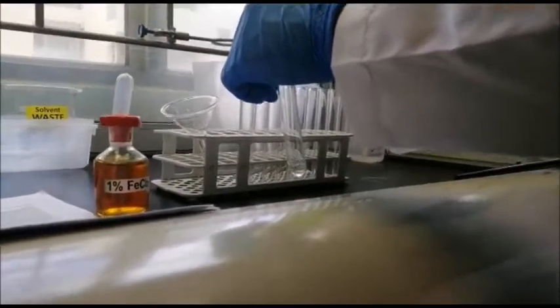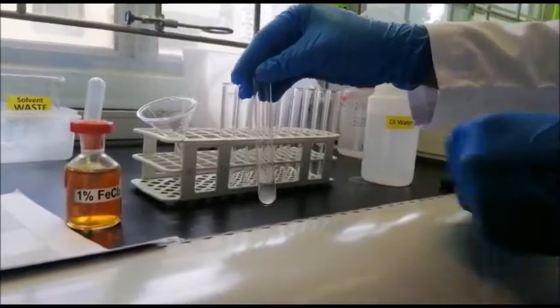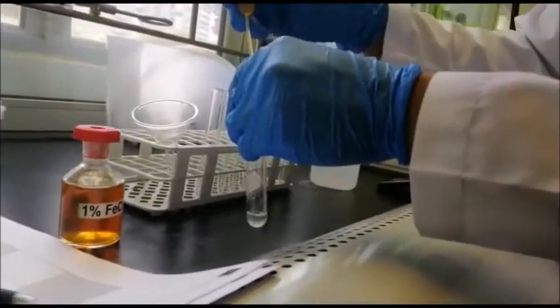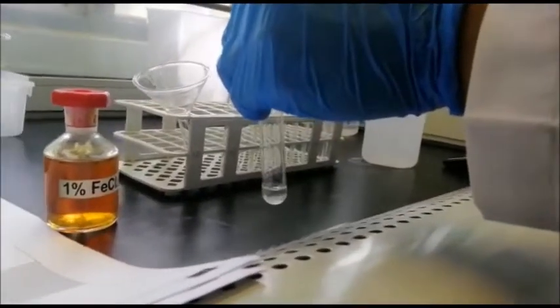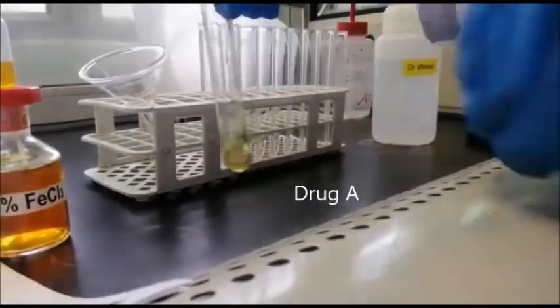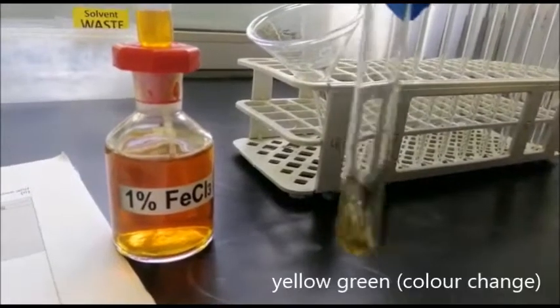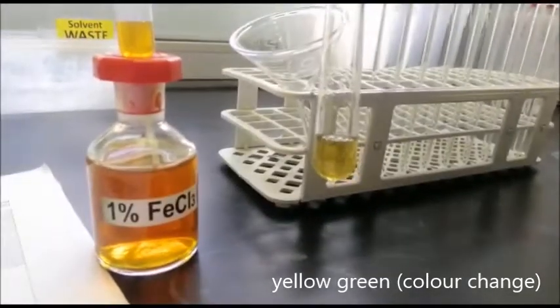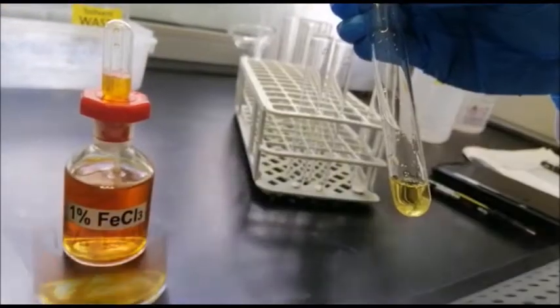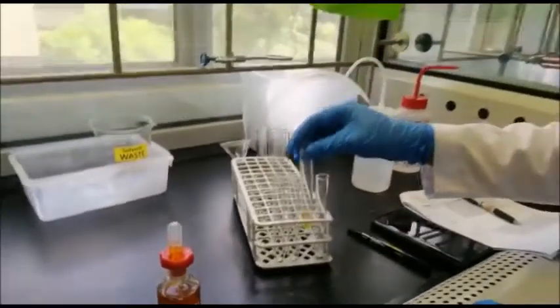We reacted the drugs with dilute ferric chloride solution in water and shook the test tubes to identify paracetamol, as paracetamol is the only drug capable of reacting with ferric chloride due to its phenol group. This worked as expected in practice, with only one drug, drug A, reacting during the test. As you can see, a slight color change is observed from yellow to a yellow-green for tablet A, whereas for the other 3 tablets, the solutions remain yellow. Drug A would later be identified as paracetamol.